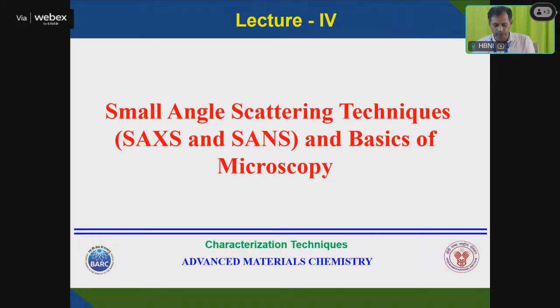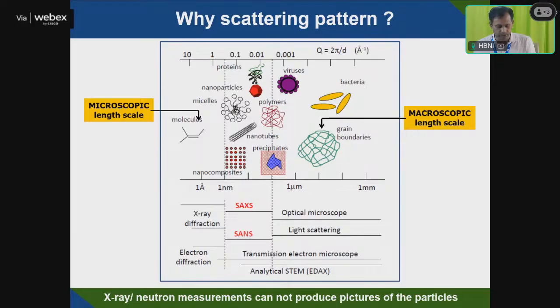So when you go to small angle scattering techniques, small angle means your angle is very, very low, so it's almost parallel to the plane. The angle is very, very low in this case. That we will discuss today.